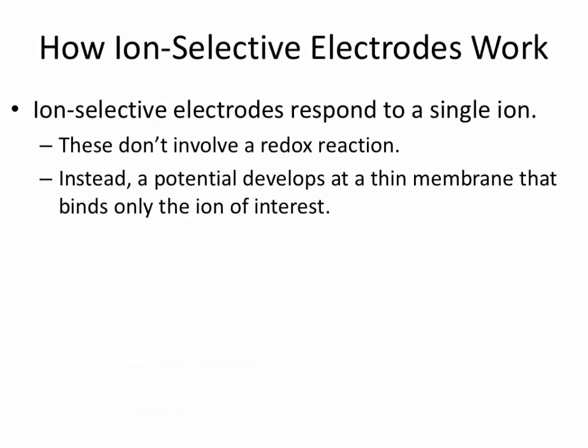Now, ion-selective electrodes respond to just a single ion, and these don't involve a redox reaction. Instead, a potential develops at a thin membrane that binds only the ion of interest, or at least ideally only the ion of interest.